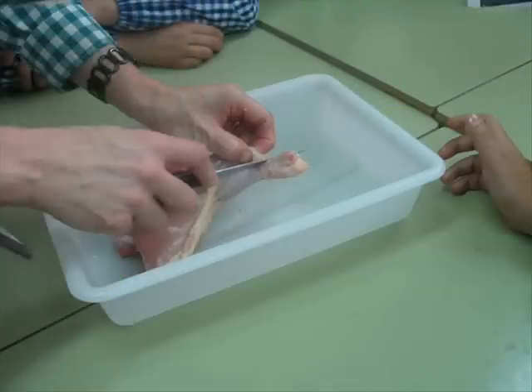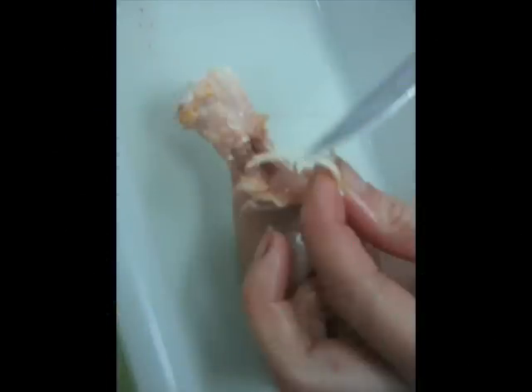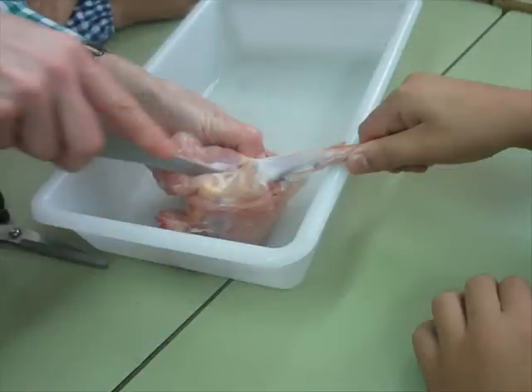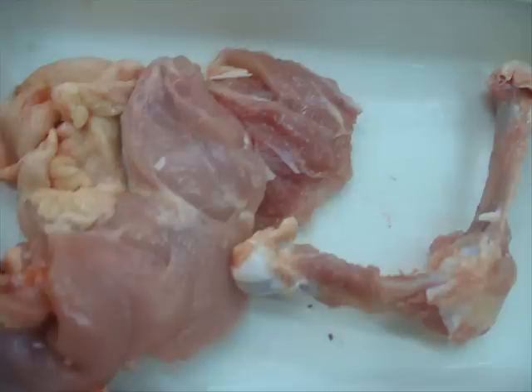Cut some meat and muscles of the chicken leg to observe the bones. Pull the tendons to check their elasticity. Separate the bones and muscles to observe the bones better. Study the knee-capped joints closely, the bone texture and their mass.